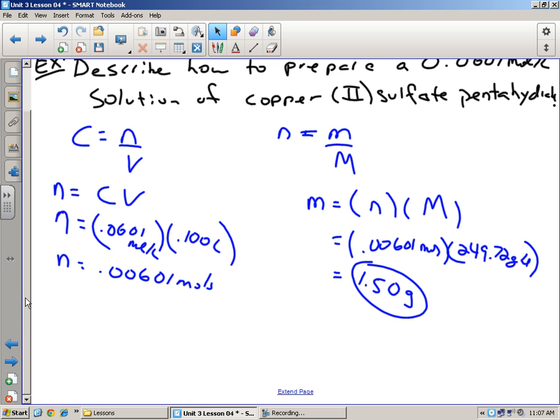Because if you pour something that's not copper 2 sulfate pentahydrate back into here, oh, we're going to have problems. Okay, and this whole jar is going to be ruined because of maybe 0.1 grams over, and we can't take that risk. Okay, so you're going to have to let me know. We're probably going to have to toss it out, probably in the bucket, and then we'll deal with it later. So if you do go over, that's what you're going to have to do.